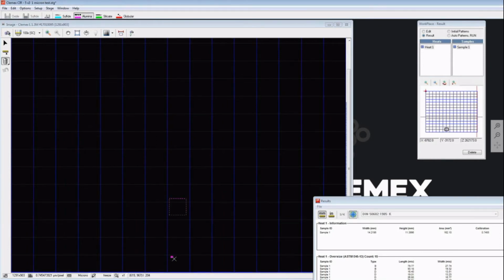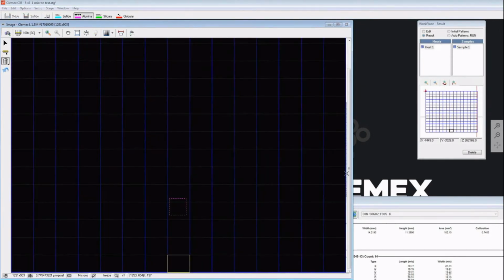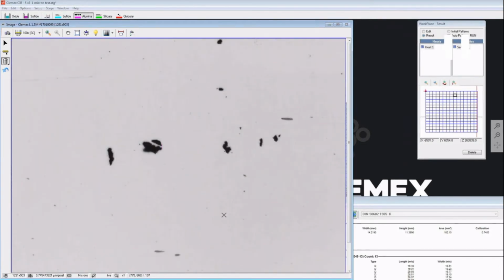On the bottom here, I look at it, this is dirt. There is another one. I look at it. You're going to notice that this was detected because of its rough shape. As I told you, alumina has a characteristic to be a rough-shaped inclusion, but the operator knows that this is not an alumina inclusion. This is actually bad preparation.